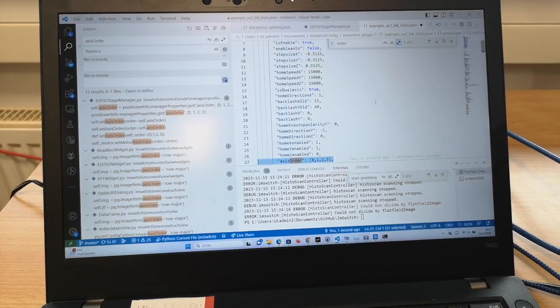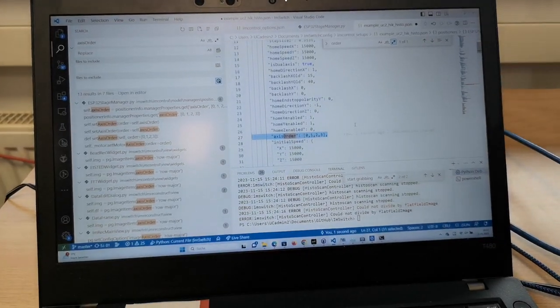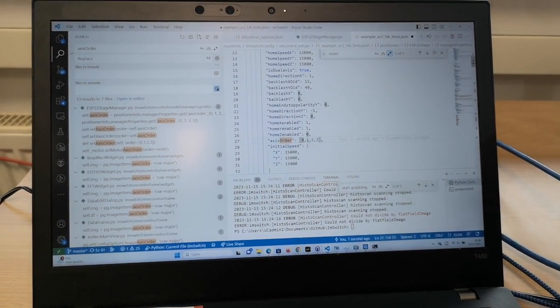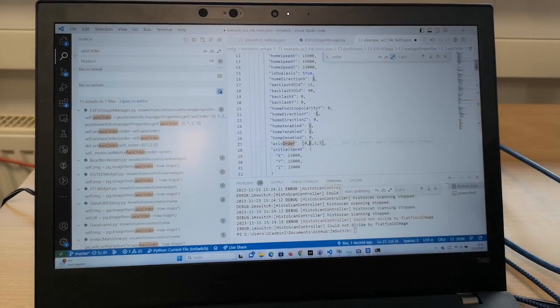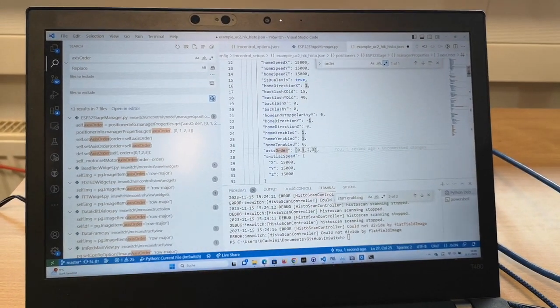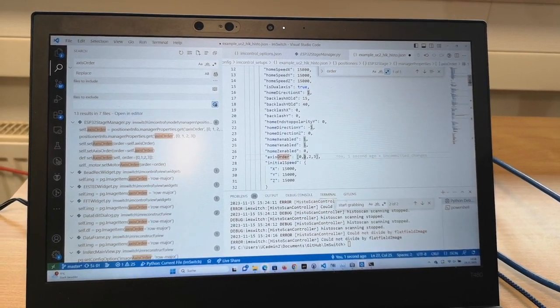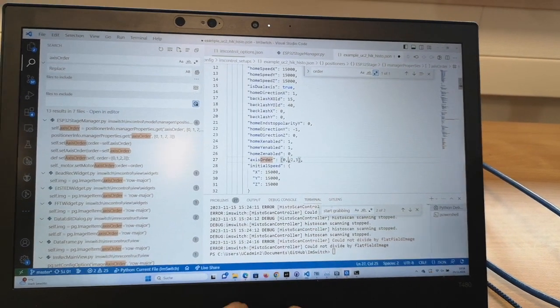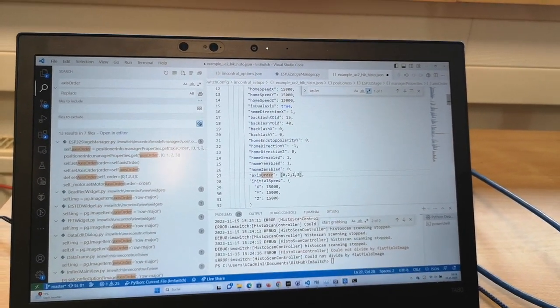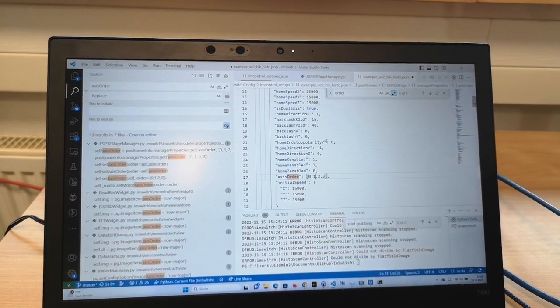And therefore in the JSON file that you have, there's an entry, or you can make an entry that's called axis order. And so, for example, if X and Y are swapped, so 0 is A, X is 1, Y is 2, and 3 is Z, then you can swap the order. For example, just say 2 is now the Y-axis and 1 is the X-axis. This is now changed, and the default is just 1, 2, 3.